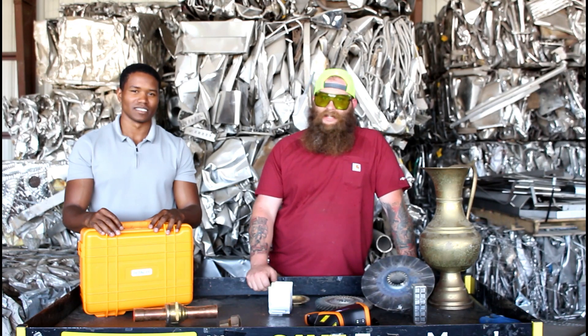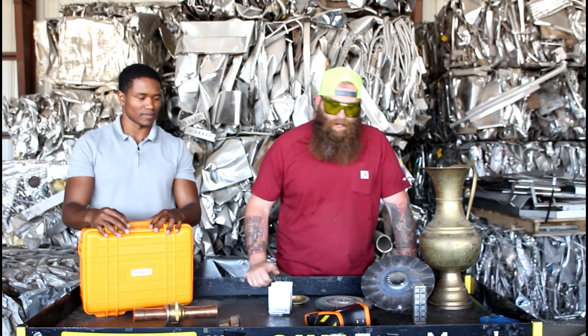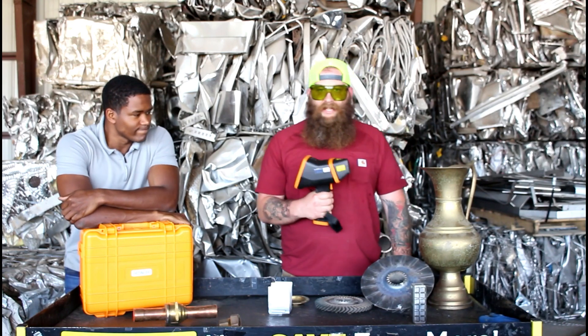Hey everyone, it's Hunter with Bracken Recycling and I'm here with Vidal from DS Enterprises. Today I'm going to be showing you all the new analyzing gun that I bought so you can check it out. It's a Vulcan Expert.